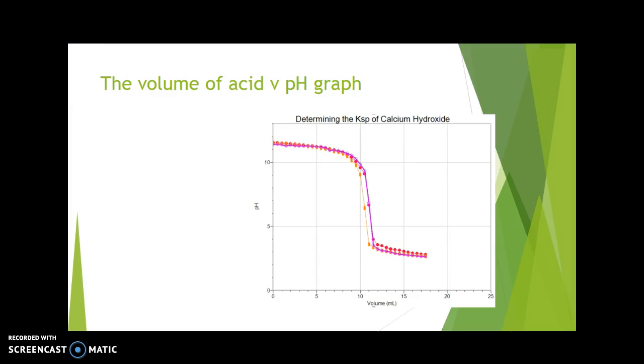You should have gotten a graph that looks like this, where you started adding milliliters of acetic acid, or more likely hydrochloric acid, so the pH is going down as the hydroxide is neutralized. Here in this area we have the equivalence point.